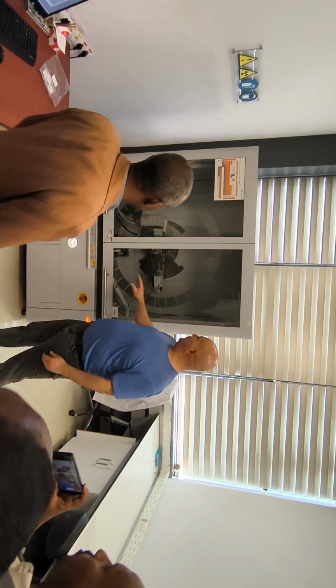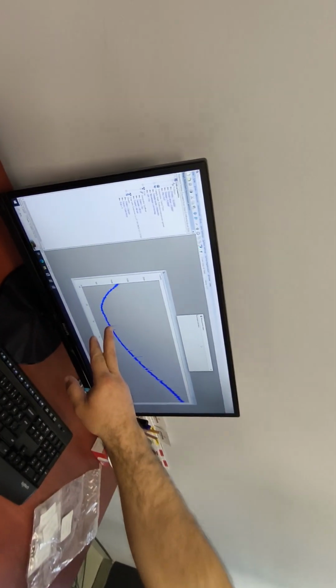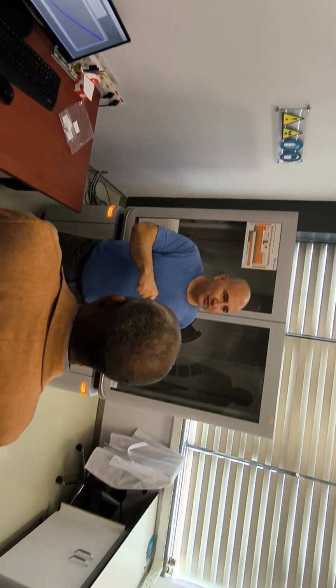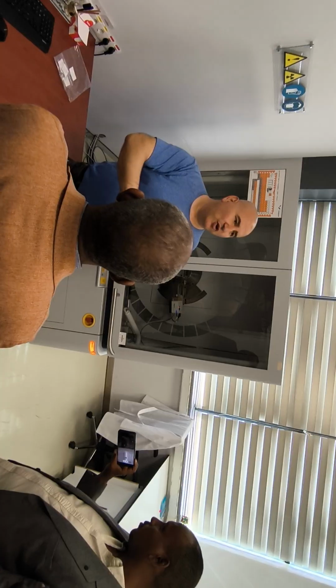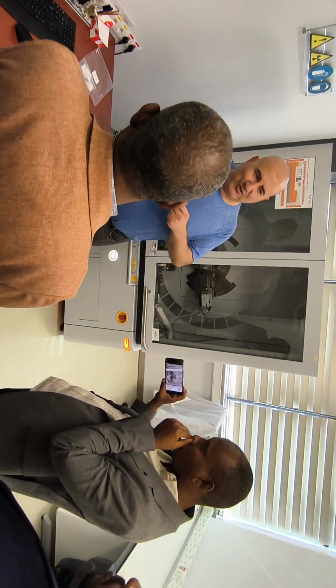It's X-ray diffraction for powder, for film, and so on. So when we have the sample here, we can get this kind of diffractogram, maybe you know, and according to the peaks, we can know which phases are in the sample. So if we have metallic gold, or gold with other compounds, or iron, or copper, and so on, we can determine here which phase we have. And according to this, we can start to think about your process.